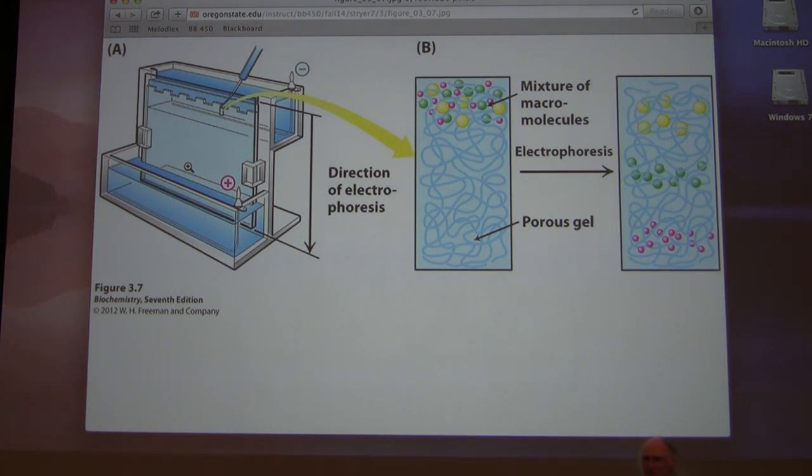And by the way, these aren't tunnels where they're going to see which one goes the longer path, this is how fast they can make it directly down through the pores. So in gel electrophoresis, the smallest guys go first, the largest guys have the most difficult time, and they go last. So we can see here, and this is shown for proteins, there's the slowest moving ones, there's the mom and dad, and the kids are way down here. Everybody with me?